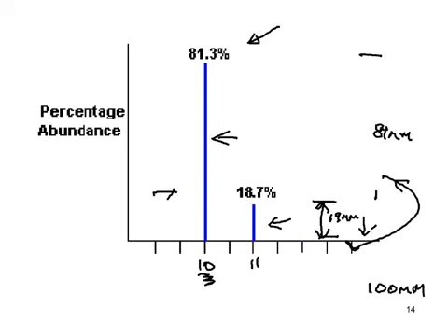Now, if you look at what fraction this is of the total of the 2 heights, it's 19 out of 100, and that in fact gives us directly the relative abundance of the isotope of atomic mass 11, 19% abundant, and the other is 81% abundant, because it was 81 millimeters of a total length of the 2 of 100 millimeters, so it's 81%. This is done more precisely. Turns out 81.3% of relative atomic mass 10 and 18.7% of the other.